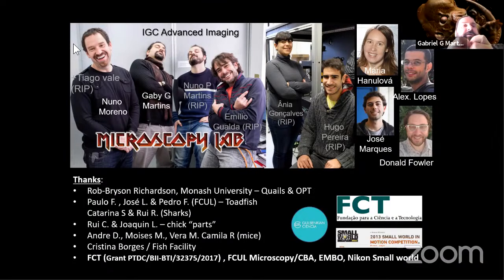People actually have put them in the microscope. I believe they've done this at Tishan Polymore. They've done this routinely. Then they come back the next day and image again, and then they come back the next day and image again, and even find the same cells, which is quite impressive.